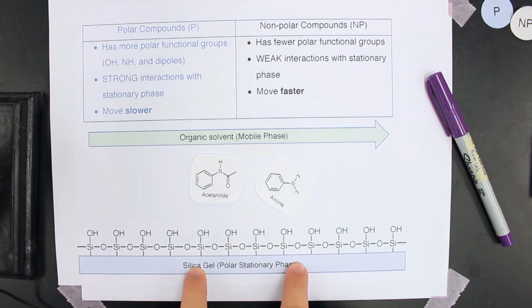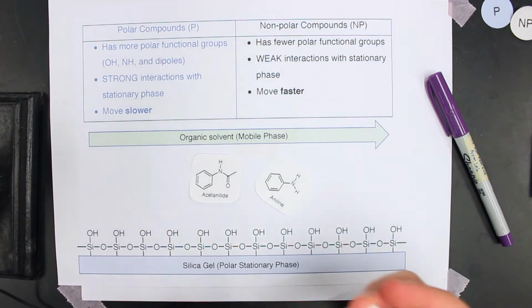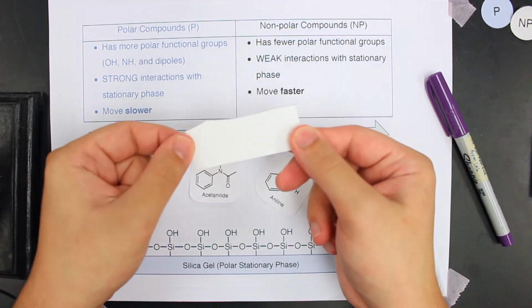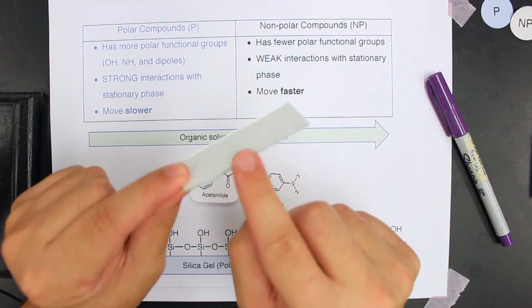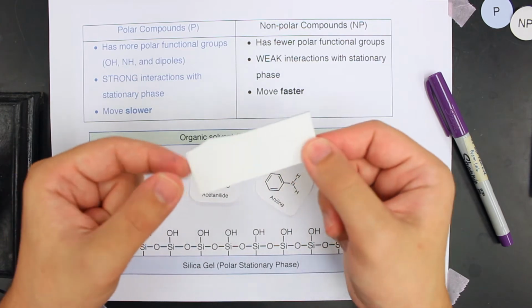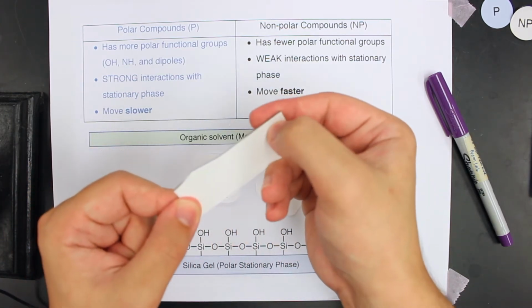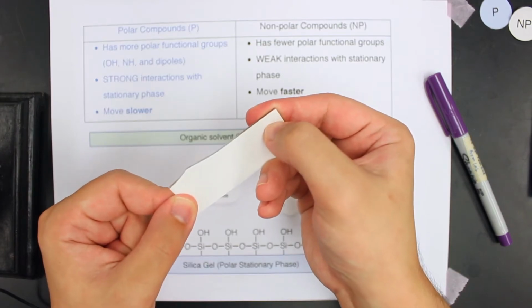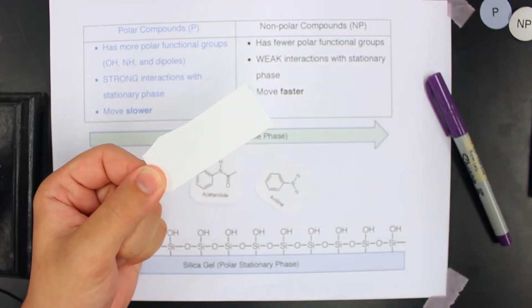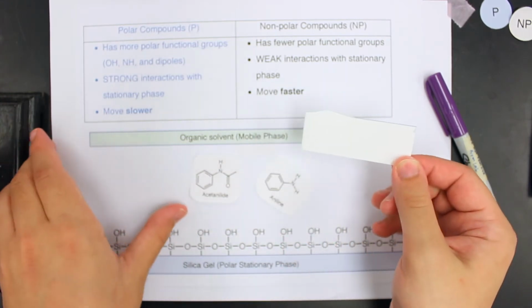We have to create something that we can put this silica gel on. Now, in the case of thin layer chromatography, we have a thin layer of this substance and we coat it onto a plate like this. You can see this is a glass plate, sometimes they're made of aluminum, but this one happens to be glass, and we smear a thin layer of this silica gel. You can see that you can even scrape some off if I etch it with my nail. If we have a thin layer of it, it's referred to as thin layer chromatography.